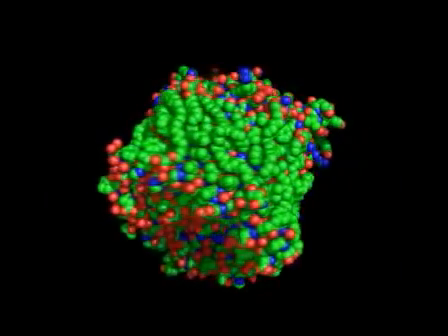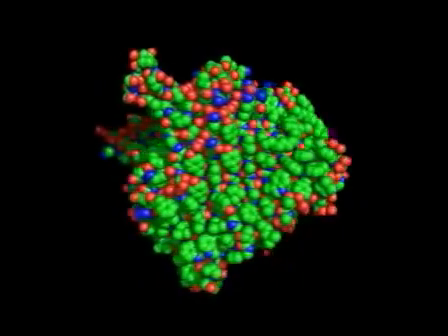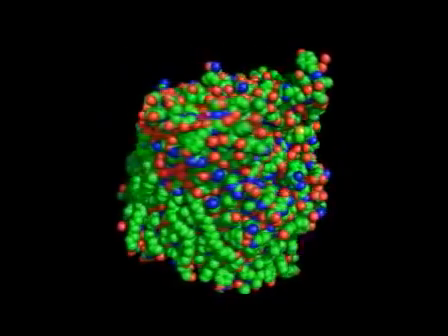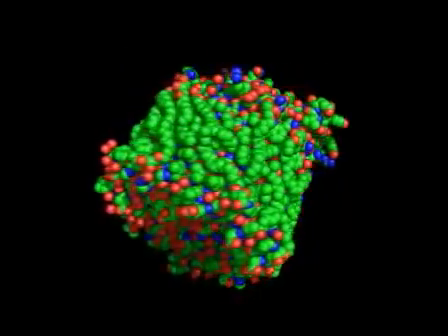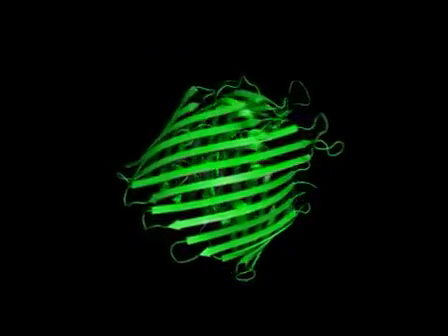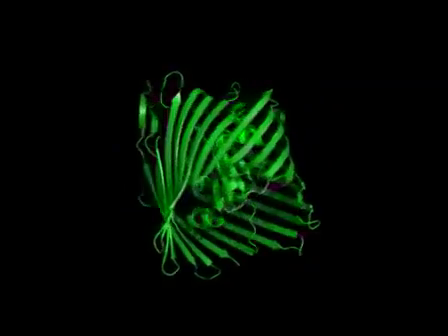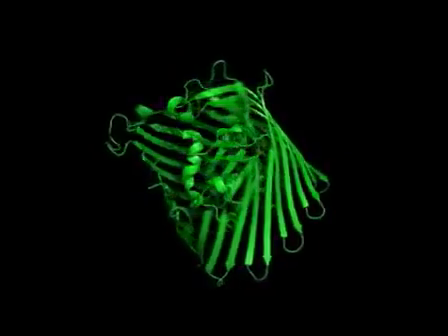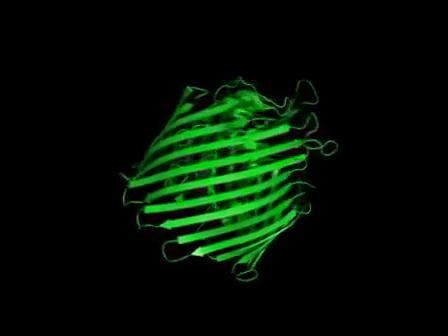The approach we take to figuring how a membrane protein works at a molecular level is to determine its crystallographic structure. This involves establishing the location in 3-dimensional space of all atoms, or at least all non-hydrogen atoms that make up the protein. The method we use for this purpose is called macromolecular X-ray crystallography, MX for short. Here we see an example of a membrane protein whose structure was determined using MX. A diffraction quality crystal of the protein is required to do MX.